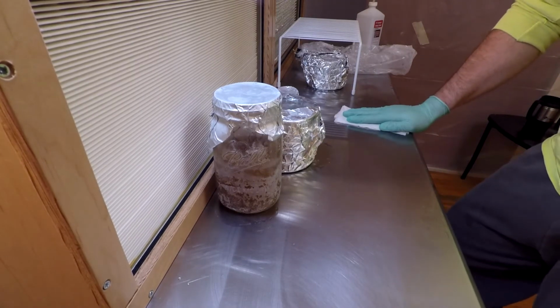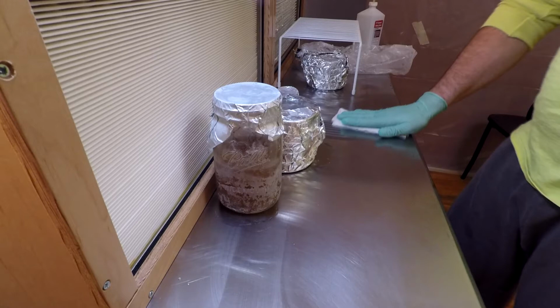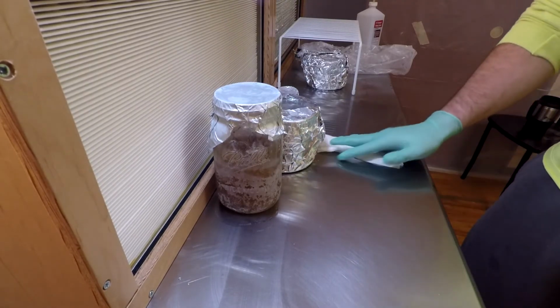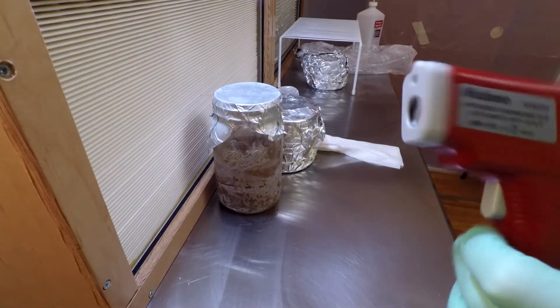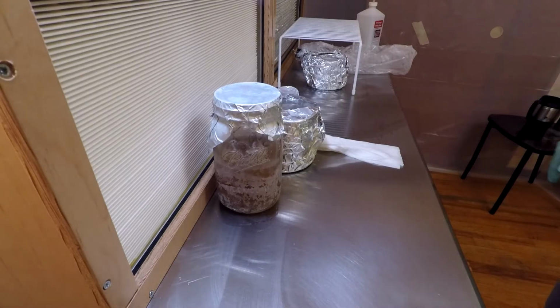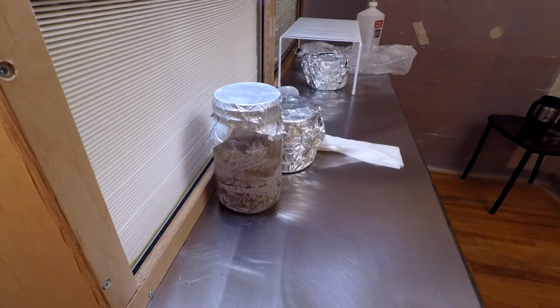I waited about an hour and a half after I turned the heat off to the pressure cooker. And you could wait actually even longer than that, but I'm trying to get things done a little bit faster. If I take one of these infrared temperature reading tools and I target it on the jar, it gives me a temperature of about 132 degrees Fahrenheit. So that'll give you an idea of how hot the jar is when it comes out.